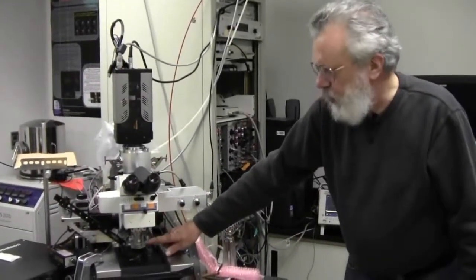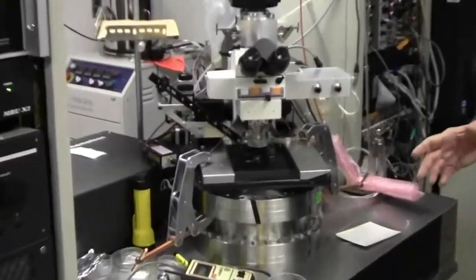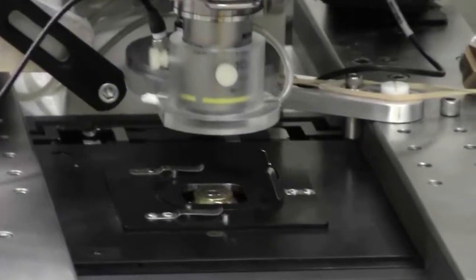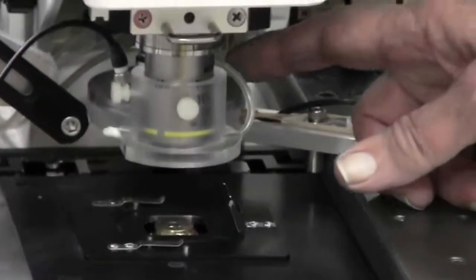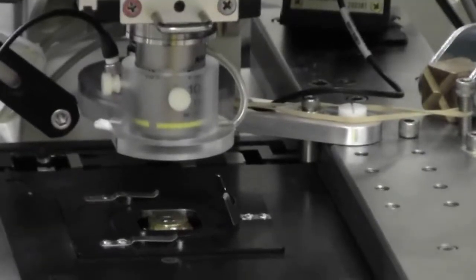There are two lenses on this microscope. One a low magnification lens which is used to scan the dish and find the approximate location of cells. And then there's a high magnification lens which is used during the irradiation for final positioning.